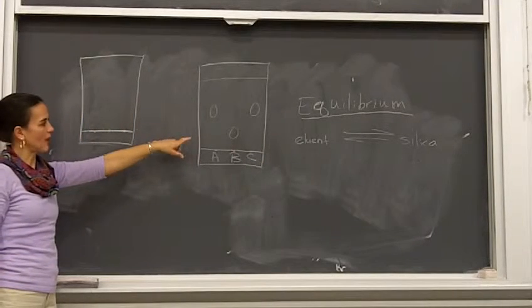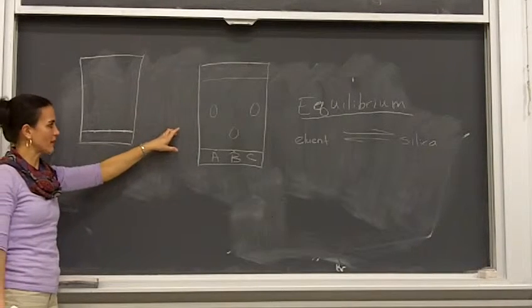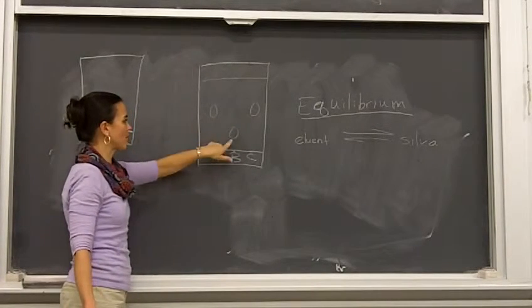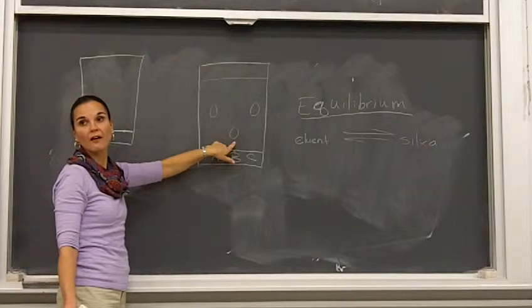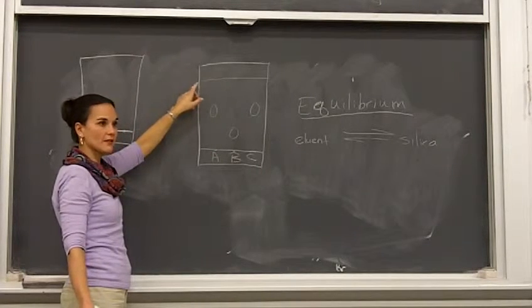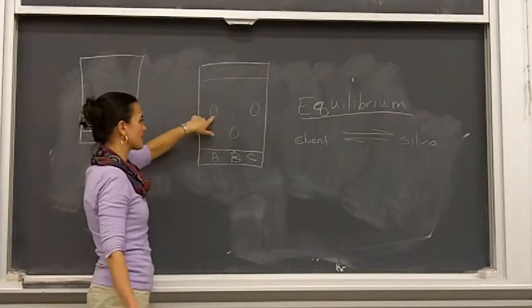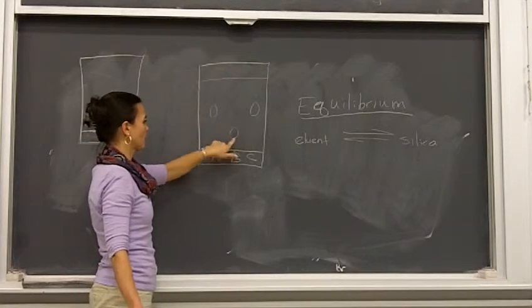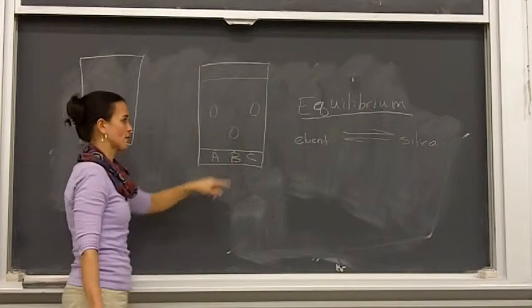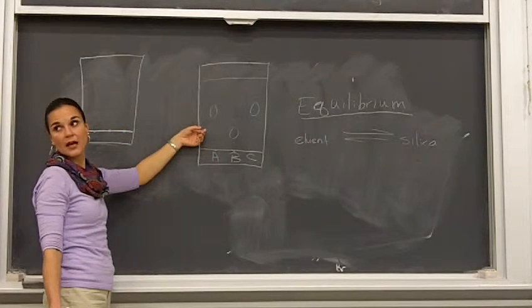Of the compounds that were developed, things that are more polar, that will hang out more with the silica, are going to travel less far up the TLC plate. So in this example, this would be the more polar compound. It hung out more with the silica instead of hanging out more with the eluent and traveling up the TLC plate. So these two compounds are less polar, and potentially the same compound, less polar than this compound. That good so far? Okay. So that's how the separation based on polarity works, separating the compounds out.